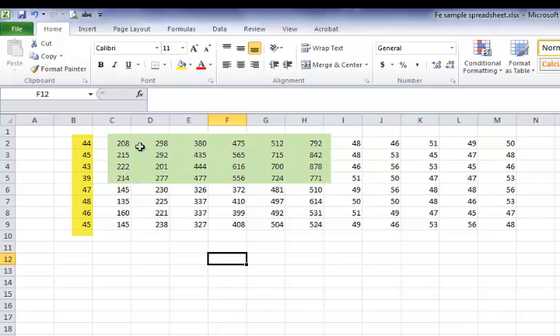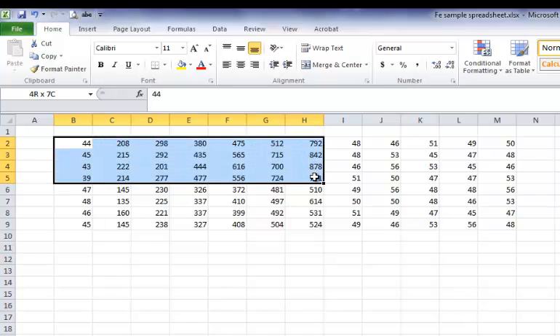I'm just going to focus on the standards for the purpose of this demonstration because we're working on a calibration curve. So the first thing I need to do specifically for the iron experiment is get this in a format that I can copy into the spreadsheet template that you are provided with on CourseLink. So I'm going to do some copying and pasting here. So I'm going to highlight just the standards. And one of the issues that we have is that our replicates are in columns here, but on the spreadsheet template, they're across in rows. So we need to rearrange these, and in Excel that's called transposing.